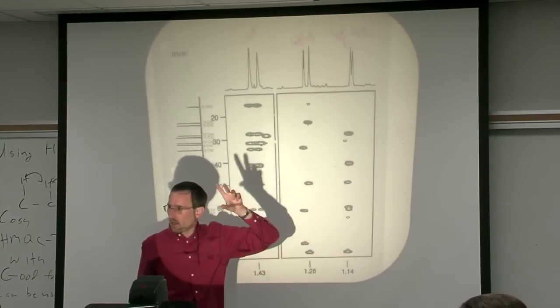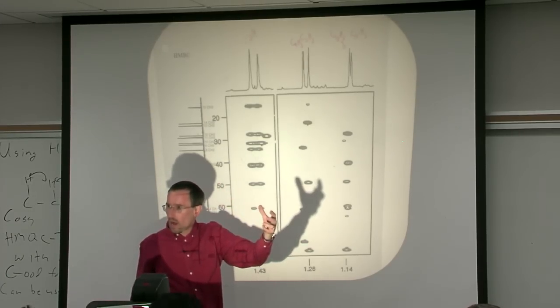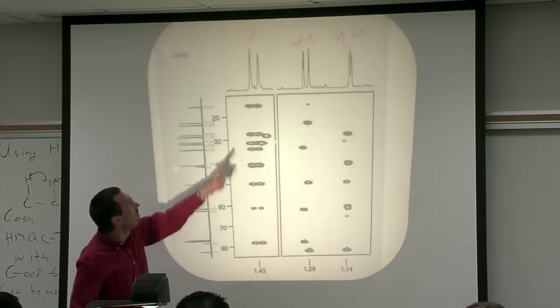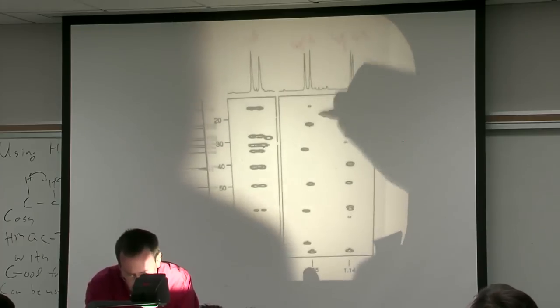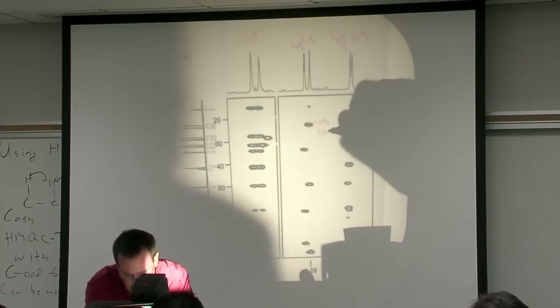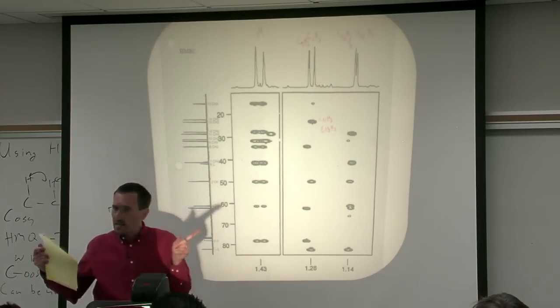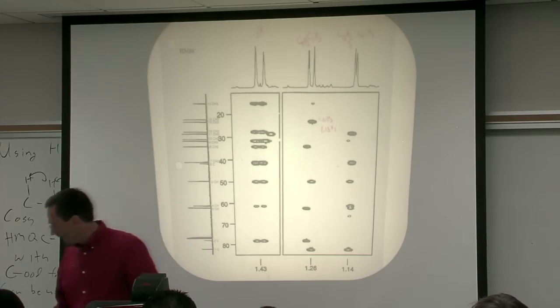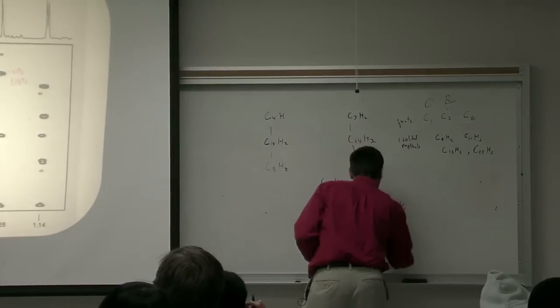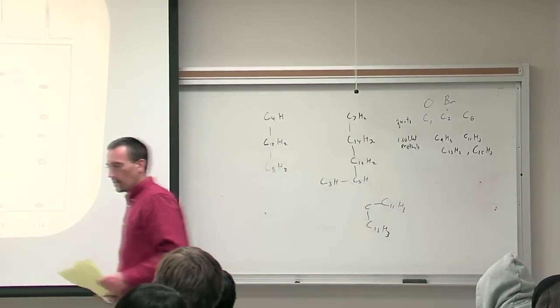Isolated methyls are great because you can use them. They're singlets, so they're going to be on a quat. They're always going to give cross peaks with carbons, the three bond cross peaks. So they're super, super powerful. So for example, our C11H3 is giving a cross peak here with C13H3, another isolated methyl. So when two isolated methyls give a cross peak, that's a gem dimethyl. So that's cool. So we have our C11H3 and our C13H3, and they're going to have to cross through a quat carbon.